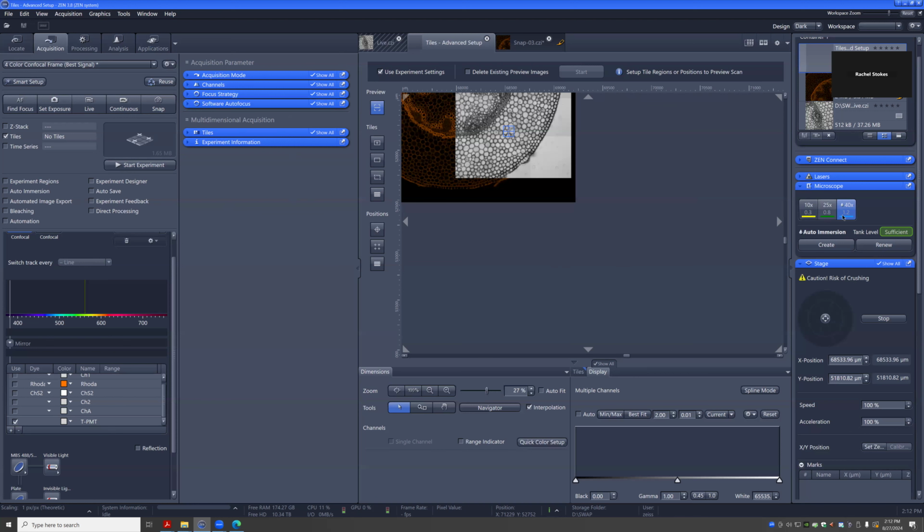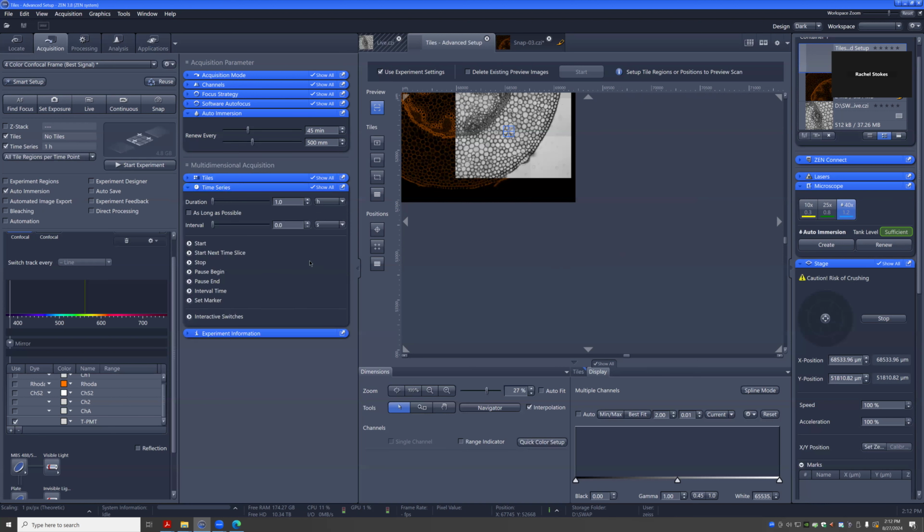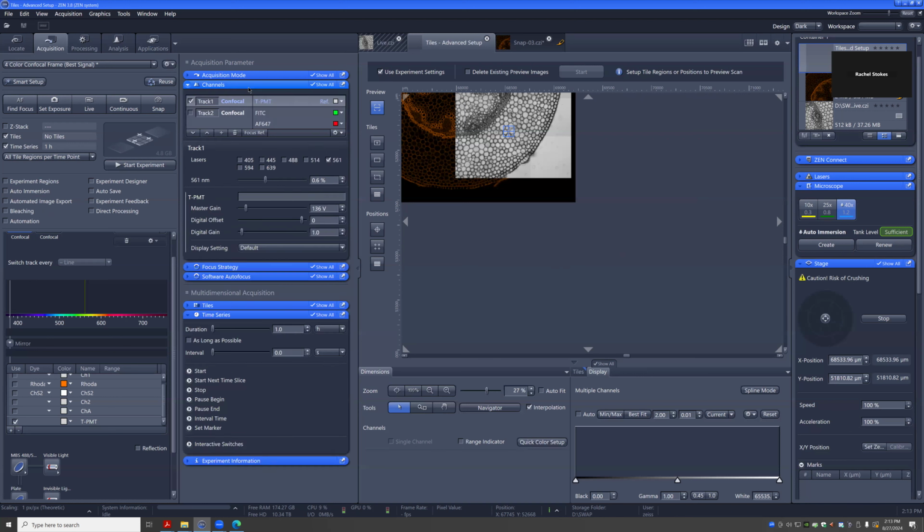But those are the main controls. I don't think there's anything else here you really need. You check this box and then you get this menu right here. Just make sure you know where that lives. It's just this little check here. And it's independent of the time series menu, so it doesn't have to coincide with an acquisition itself. It's very independent, which you would want regardless. The menus look similar, but they have slightly different parameters. Let's see if we actually have anything to see.